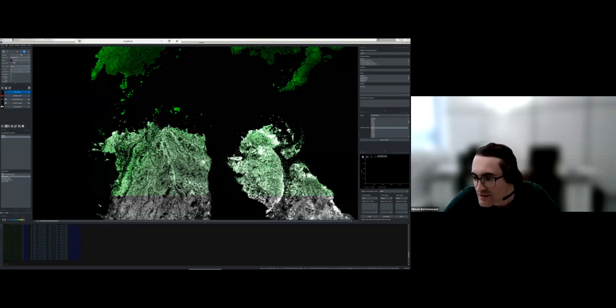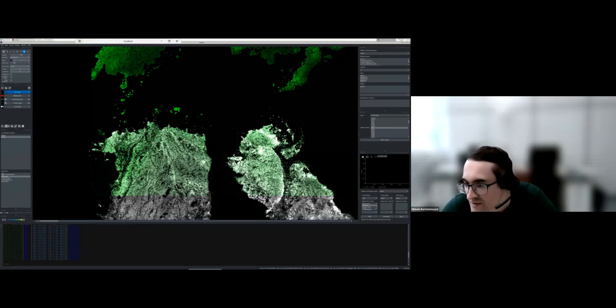So for the x-axis, I want my cell area. On my y-axis, I want the transcript count, and then I want to color by sample. And we can plot it.